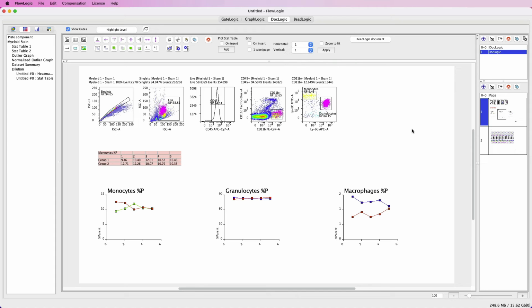The only elements that aren't updated when pasting the settings are the group colors and the graph labels, as we want it to be possible to copy settings between different graphs even if there are different numbers of groups. And of course, we don't want all graphs to be labeled the same, which would make them indistinguishable. The same goes for other elements in your report.